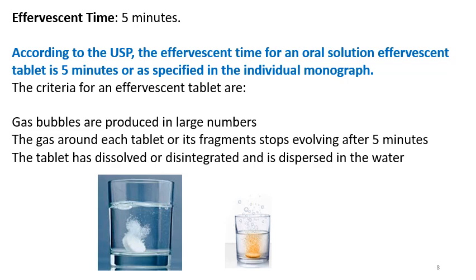Whenever you are working on effervescent formulations, always protect these tablets and the raw materials from moisture. Carry out the manufacturing operations in low RH areas. For measuring the effervescent time, 200 ml of water is filled in 6 beakers, and 6 tablets are required to be tested for effervescent time. General criteria for effervescent time is not more than 5 minutes.